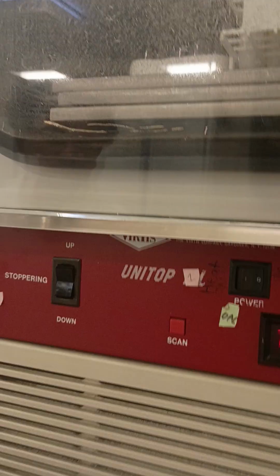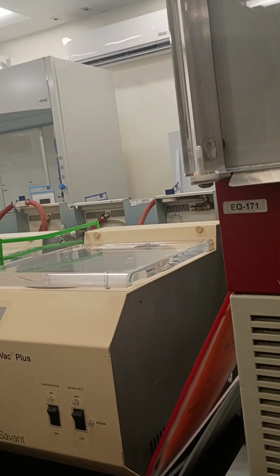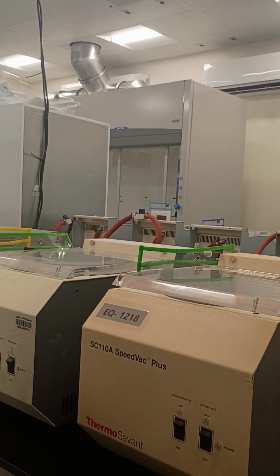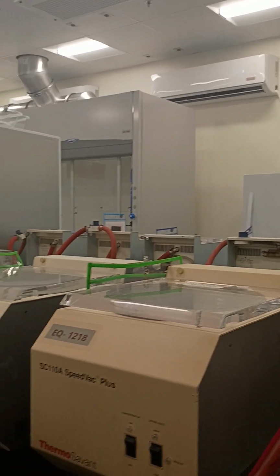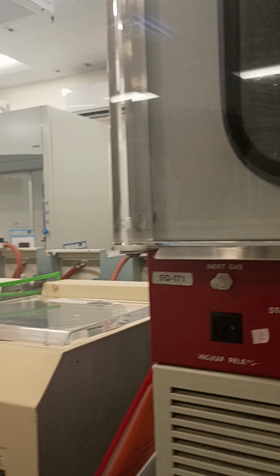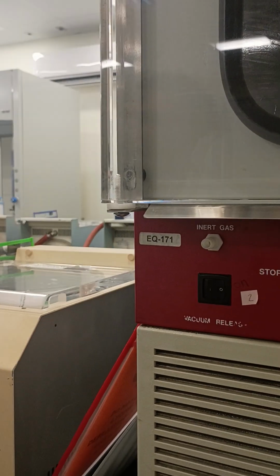The vacuum comes from outside into the system, but it's not in the system until you turn it on. So when you turn it on, you seal it. If you don't seal it, it's going to start leaking out of here. At the end, when it's done, you turn off the heat and open the vacuum to release the pressure, because it's under pressure, so you can unlock the door.